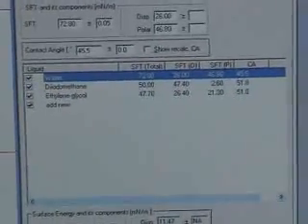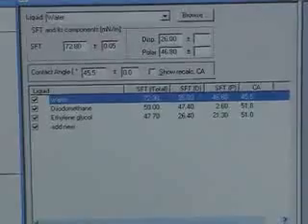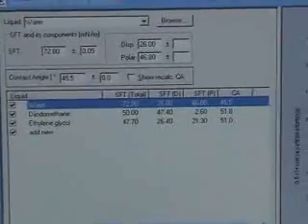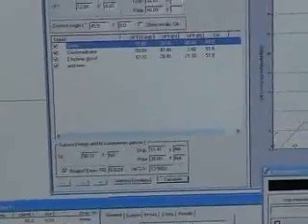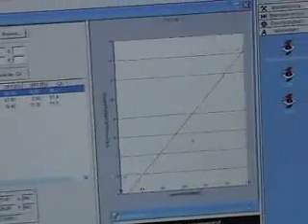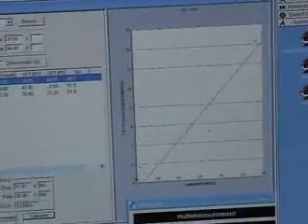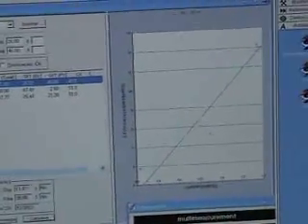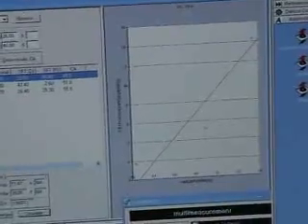They have been taken over in this window and the surface energy has been calculated here to be quite high, about 50 millinewton per meter. Here we see the typical Owens and Wendt diagram for this measurement.